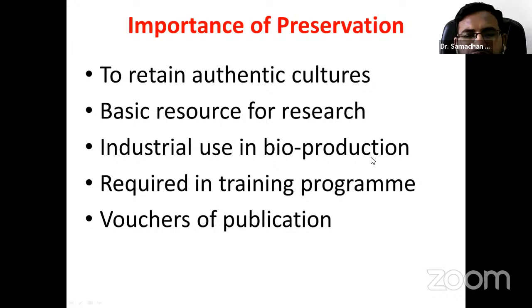For that purpose you can use pure cultures, which you get from the culture collection. It is required in training programs. It is also required for publication, where publishers ask for your deposition number of the culture collection. That's why preserved cultures are so important.